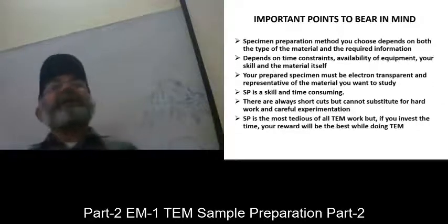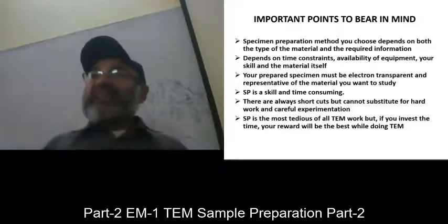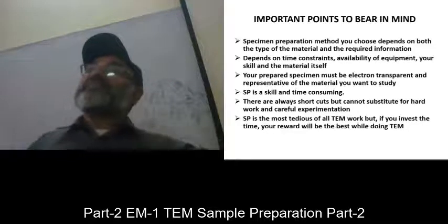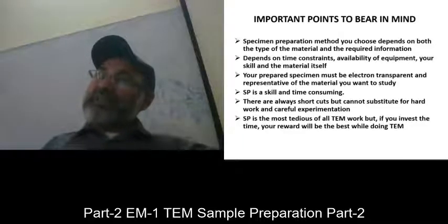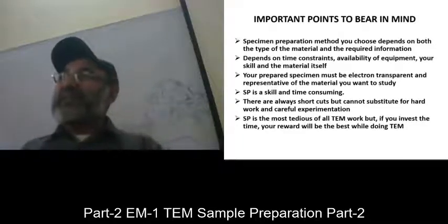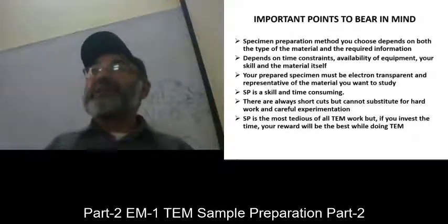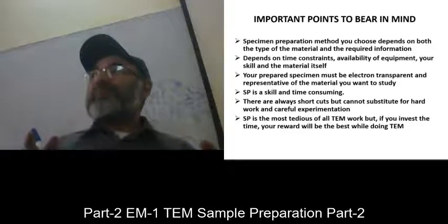In other words, a number of crystals which could be signatures of a particular phase, you missed them and the other person saw them. So if you don't know that he used 300 kV and I used 100 kV, then you can't explain that result. You can't defend that result. Right? So full information should be given.